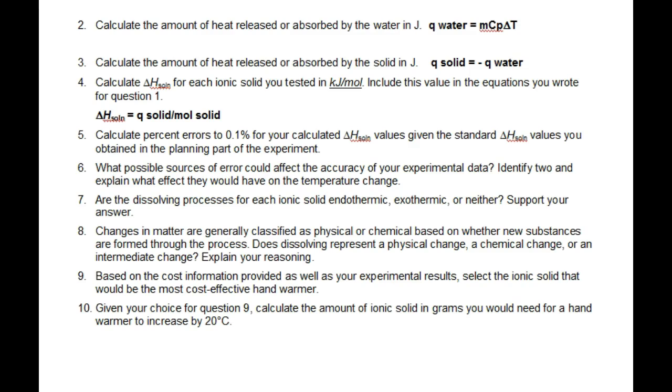Number 7, the dissolving processes for each ionic solid, endo, exo, or neither. So based on the data that you collected, would you expect the solids to be endothermic? Would they absorb heat in order to go to that change? Would they release heat, be exothermic, or did they not change at all?